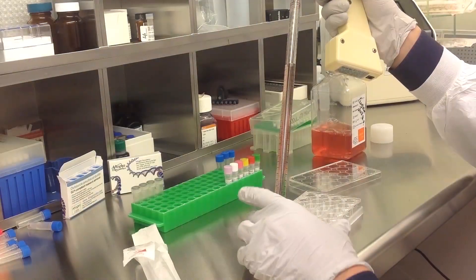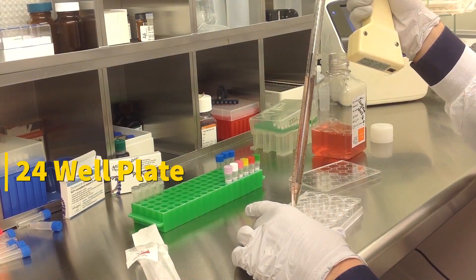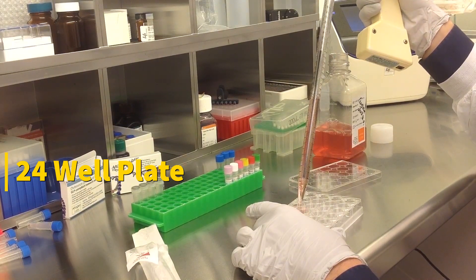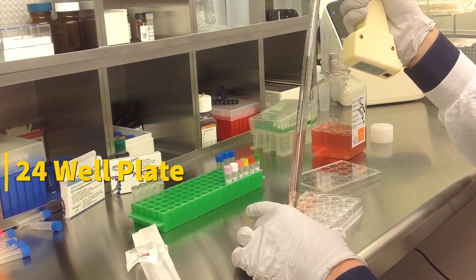Today we will be transfecting HUH7 cells obtained from ATCC. We will be using a transfection kit manufactured by Altagen Biosystems. In this tutorial, we use a 24-well plate. Transfections can be scaled up or down based on plate surface area as described in the corresponding transfection protocol, which can be found at altagen.com.